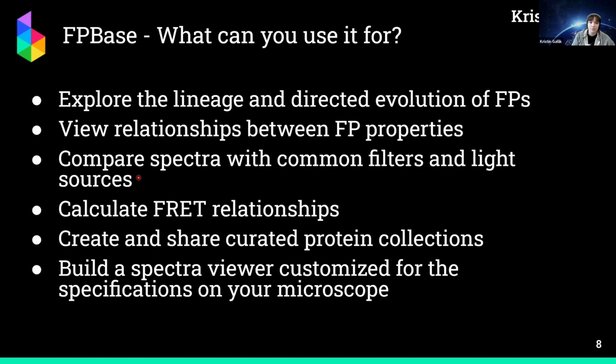So what can you use it for? You can explore the lineage and the directed evolution of fluorescent proteins, which I think is kind of cool to see. You can see relationships between different fluorescent protein properties, compare spectra with common filters and light sources. You can calculate FRET relationships if that's of interest to you. You can also create and share your own curated protein collections. So this would be like your own little curated resource for yourself. You can also build a spectra viewer that's customized to the specifications of the microscope you use, so you can very easily figure out what fluorescent proteins or dyes might work with your microscopes.